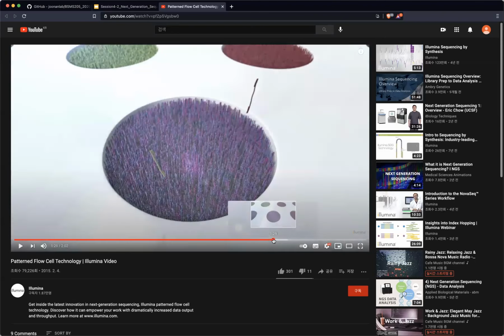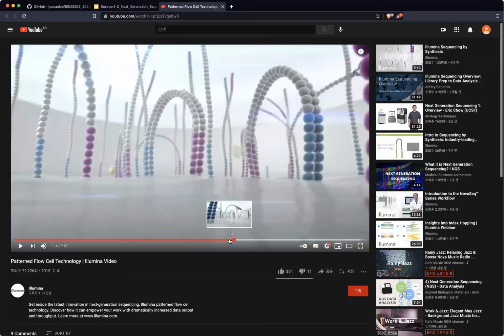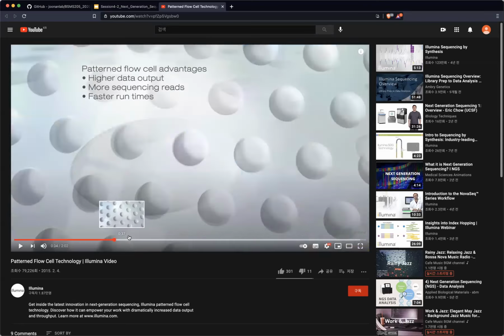So sequencing like the first position. Then once it's all done, you will see whether these positions have a certain amount of fluorescence or not. So one thing I missed in here. Once you have all of these primer stations, back to here, it has lots of arenas where primers can be bound to the DNA library, right? So in theory, you put one DNA library into this area, right?